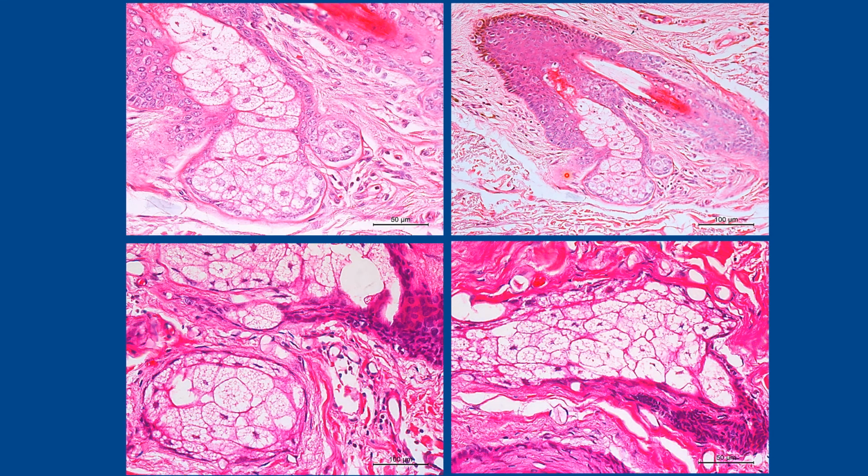These four pictures show the sebaceous gland and a hair follicle. This is the root of the hair. This is the sebaceous gland about to open into the hair follicle, and certain muscles are here. These are the erector pili muscles. Here also there is another erector pili muscle.